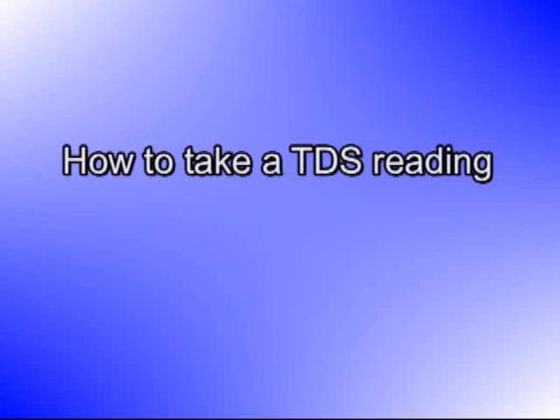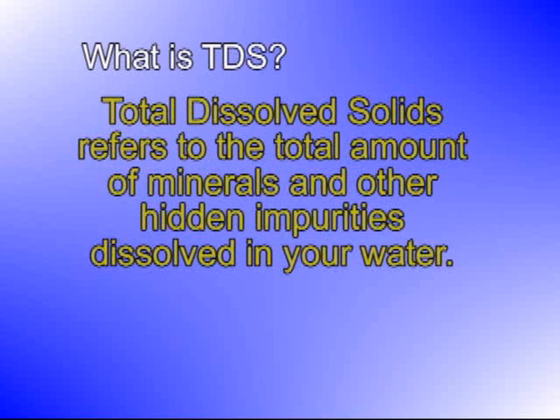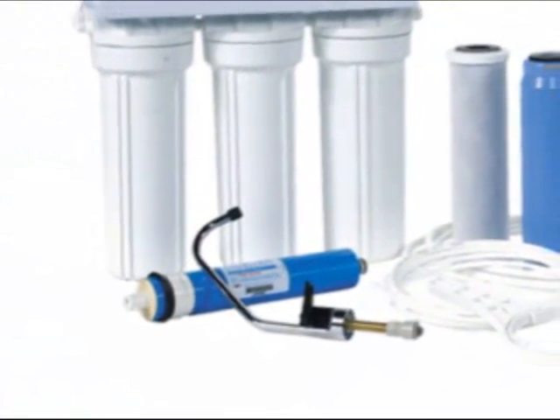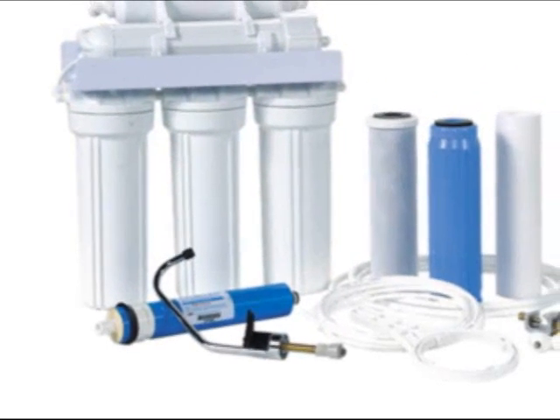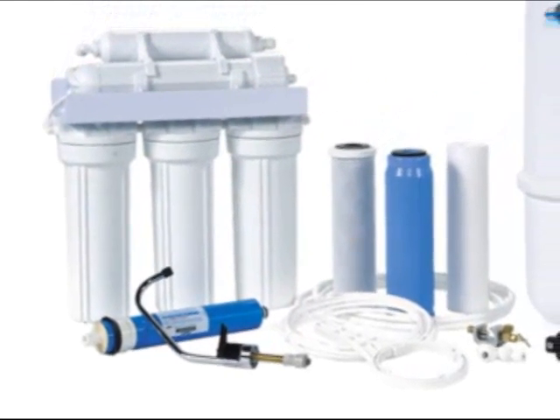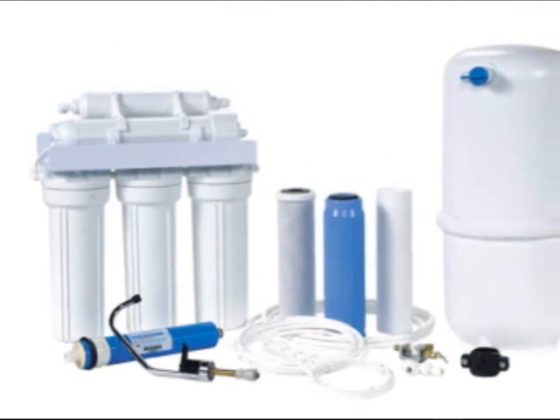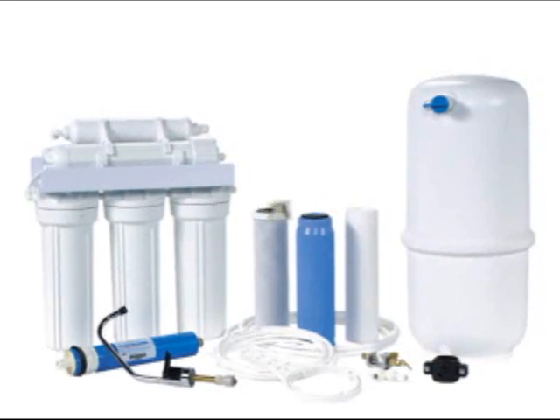How to Take a TDS Reading. Total Dissolved Solids refers to the total amount of minerals and other hidden impurities dissolved in your water. If you have a reverse osmosis system, you need to periodically check the RO percent rejection to make sure it's working properly. RO percent rejection is the percentage of contaminants that are removed or rejected from the tap water by the reverse osmosis membrane.